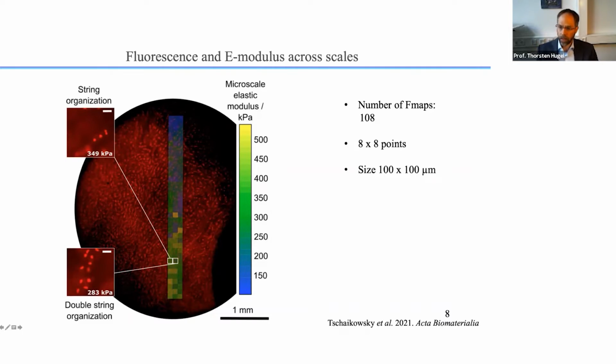And I have to say, if you just look at this completely macroscopically with the light microscope, it looks intact. This is after surgery of a person who had a problem with a knee, but this is basically the best part you could extract from this, and it looked intact. But here you see, there's already something going on.